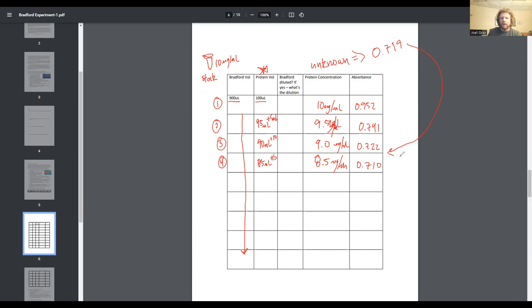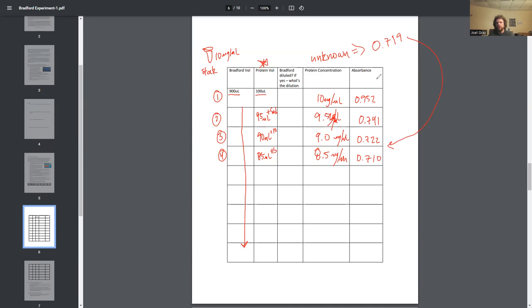This would be a very powerful sort of calculation that you can do, to watch these very gradual changes in concentration lead to gradual changes in absorbance. Now, the value of that is all going back to think about Gen Chem 1 sort of stuff, accuracy and precision. You're very precise by having a narrow range of absorbances in which to calculate.